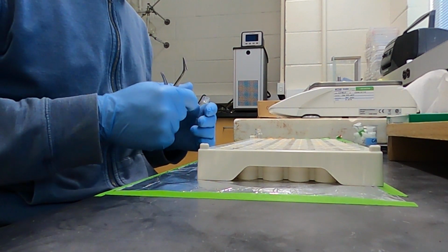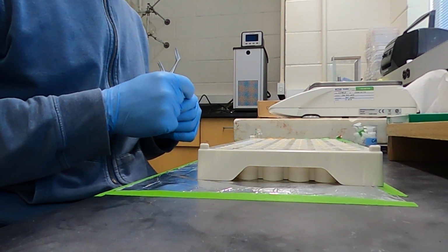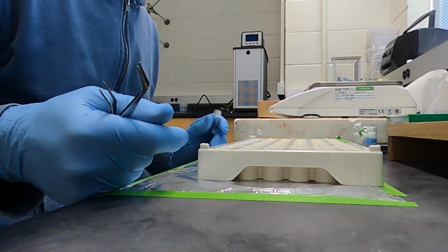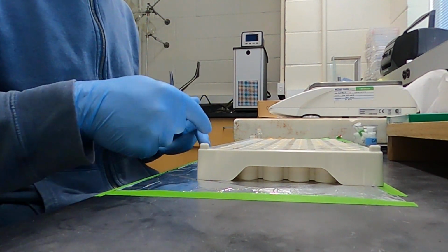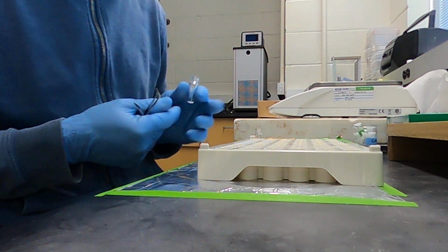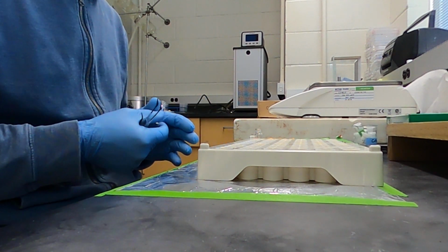correct for it. That means we're gonna try to see how it changes with the weight of the samples and correct for it. And the way we do this, we take one standard and we put several amounts of that same standard, like in several different vials. We put different amounts. Like today I'm gonna put 30, 60, 90, 120, something like that. Okay, 4 or 5 of them. We try to encompass all of the possible weight that the samples will return.